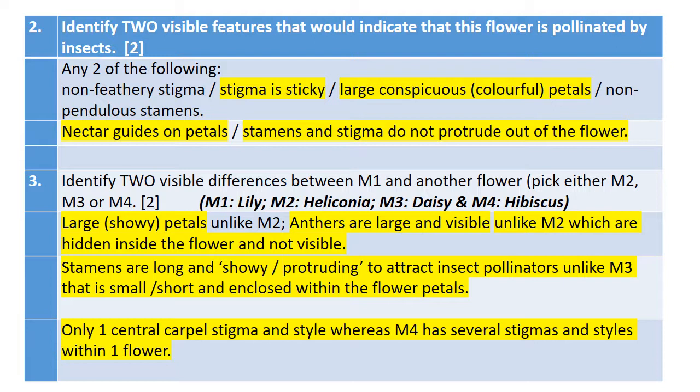Besides petals, you can compare anthers, stamens, and carpels. These are some of the things that you can compare.